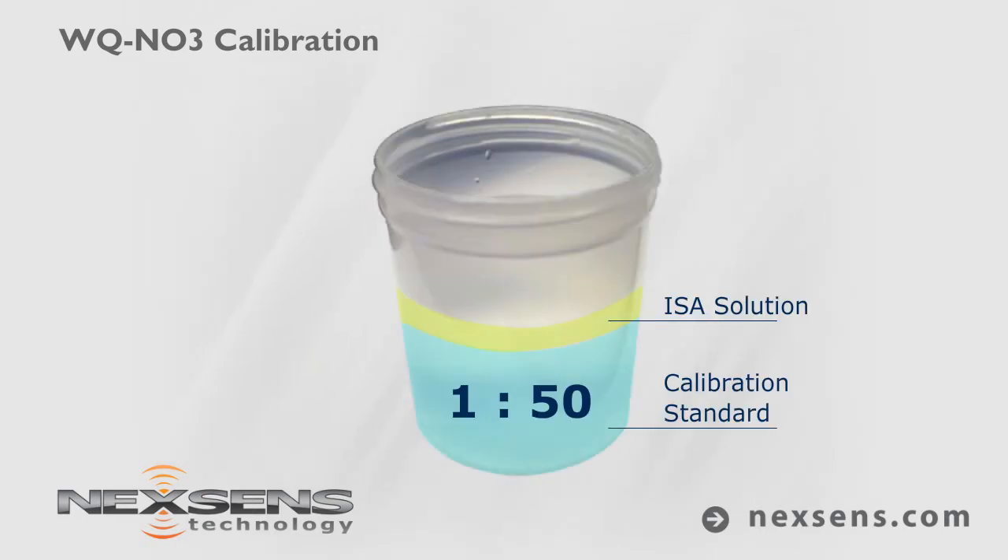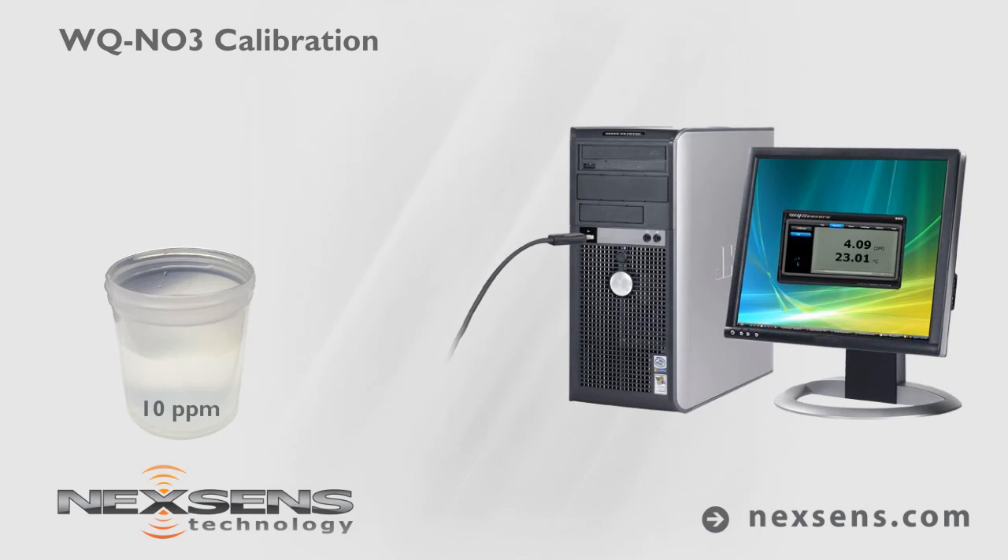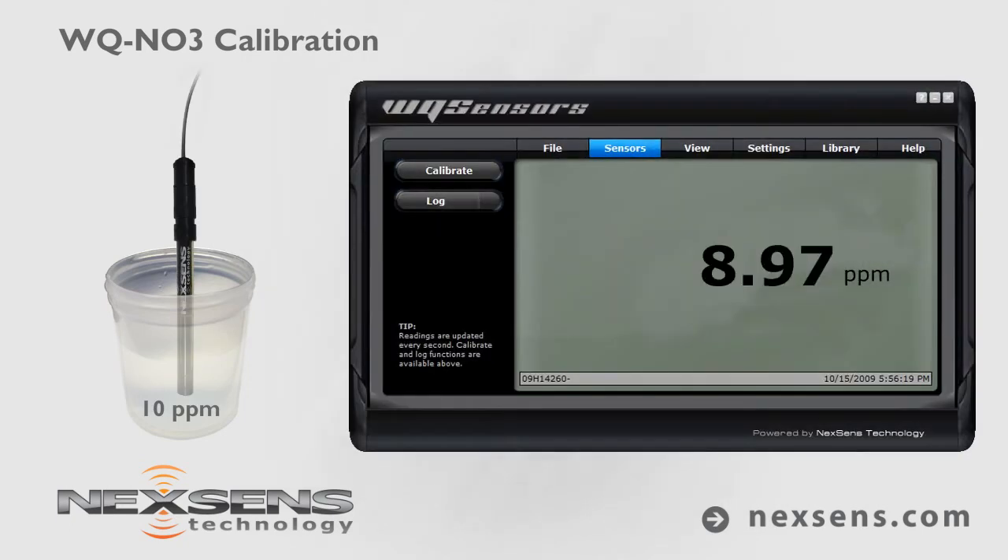For best results, use an ionic strength adjuster at a 1 to 50 ratio of ISA to calibration standard. With the sensor connected to your computer and the software running, submerse the probe in the 10 parts per million standard.